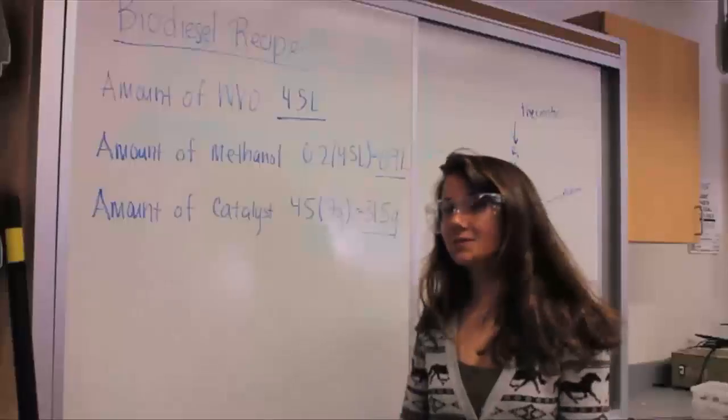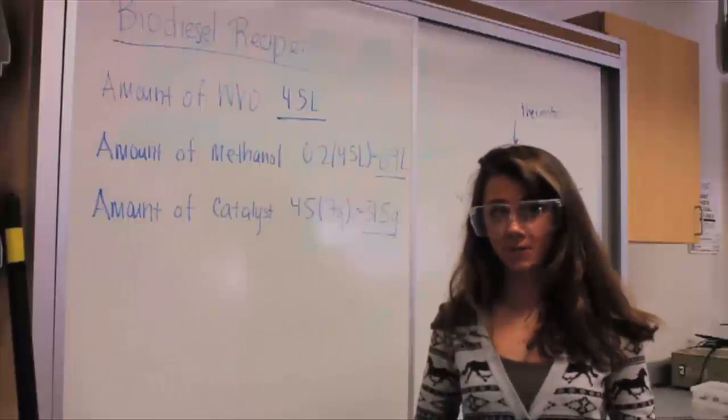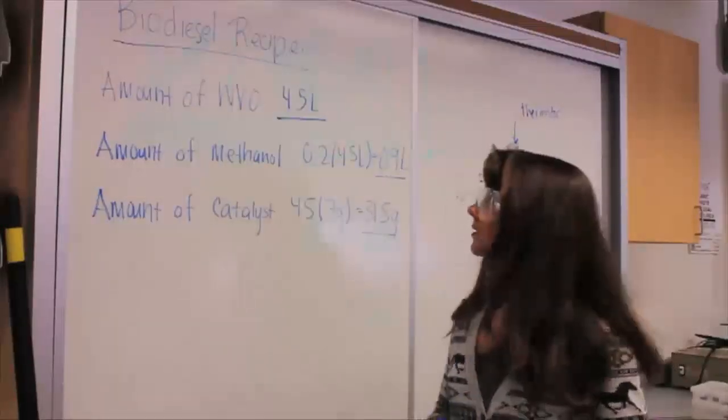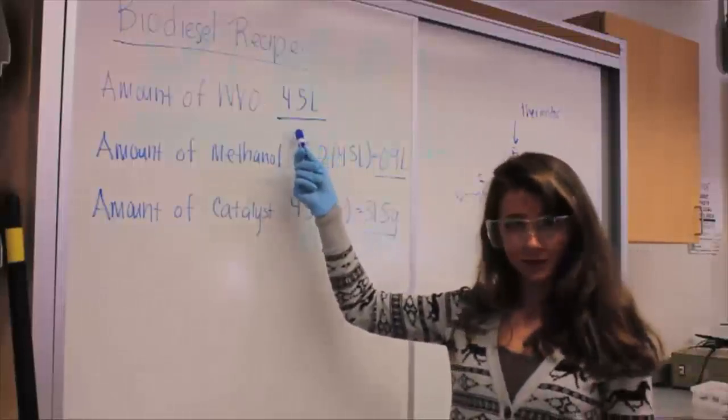Let's take a look in the lab. Hi, so I'm going to show you a general process of how we make biodiesel. In order to make biodiesel, you need waste vegetable oil. So today we're using 4.5 liters of waste vegetable oil.